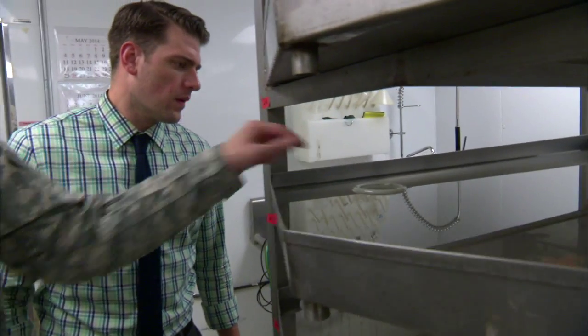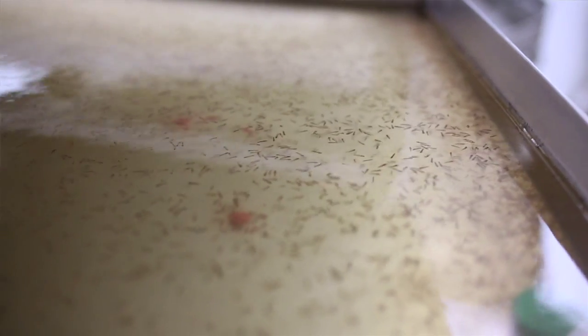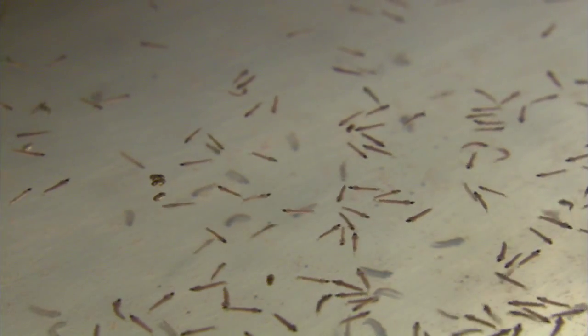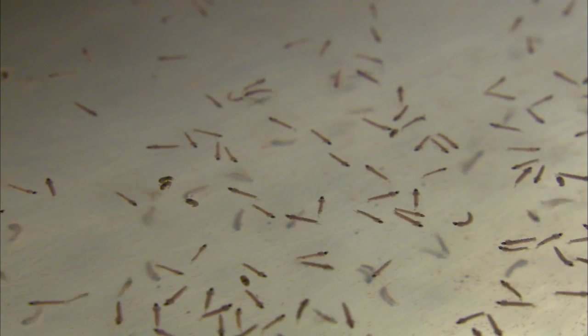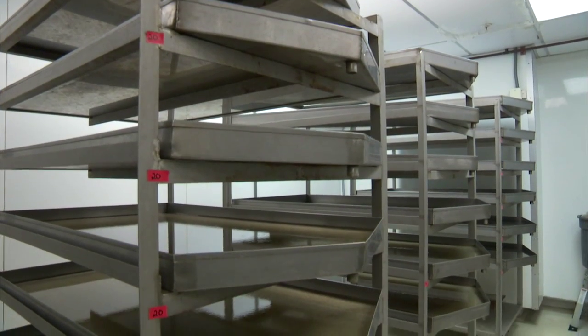We add the eggs of the mosquitoes with these little rings to keep them in place. Then we add yeast for them when they first hatch out of the eggs, then fish food later on. They go through four different growth stages of larvae — we call those instars. It takes about eight days from when we put the egg in until they're pupating and ready to pull out of these racks.